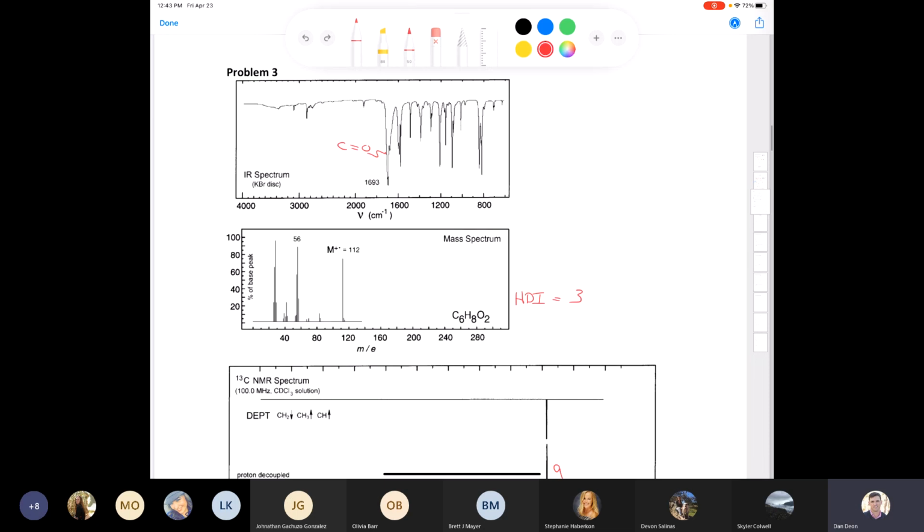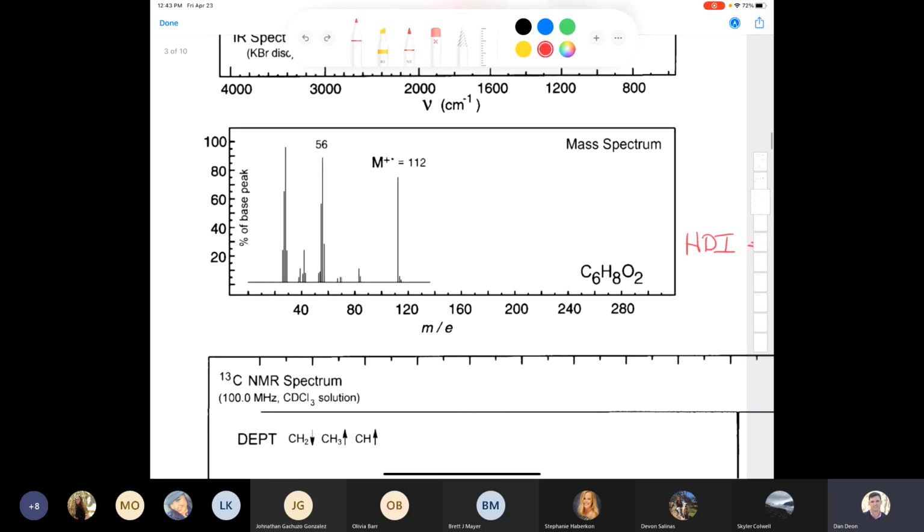All right. What else? Is there anything interesting that we can garner from the mass spec? Okay, nitrogen rule. We have no nitrogen present. There's no N plus 2 ion, so no chlorine, no bromine present. We're given the molecular formula anyway. Something else that's interesting is that you see you have the molecular ion. There aren't a whole lot of fragments in here, but I have a fragment right at 56. Now 56 is half of my molecular ion, right? 112 multiplied by 1/2 gives you 56.